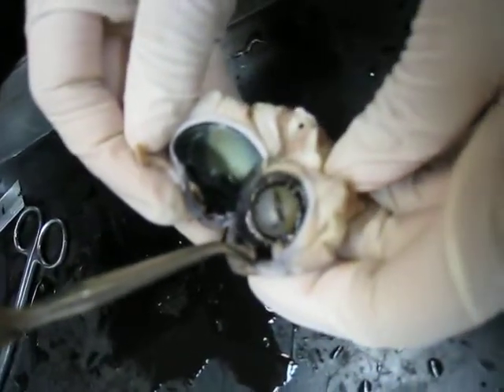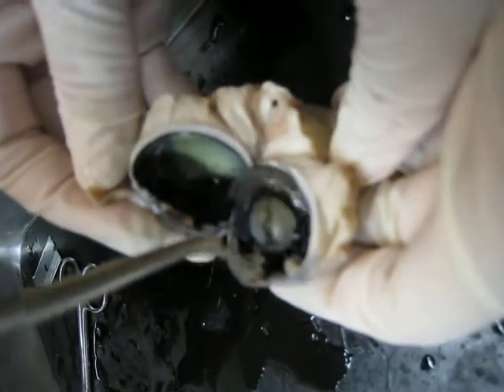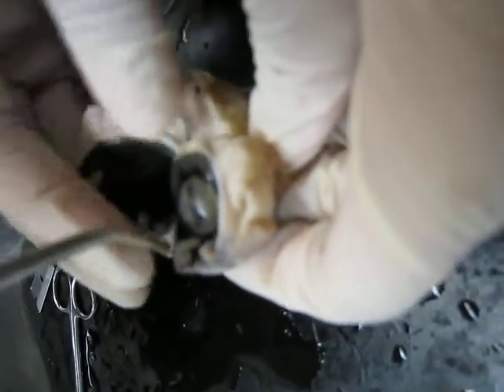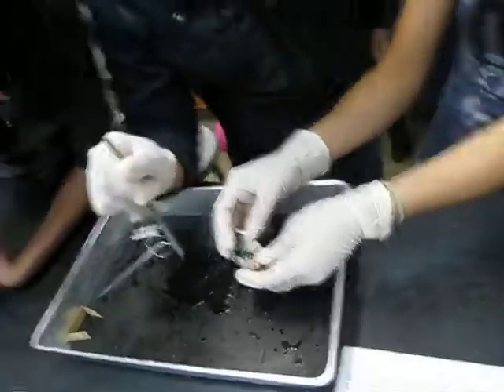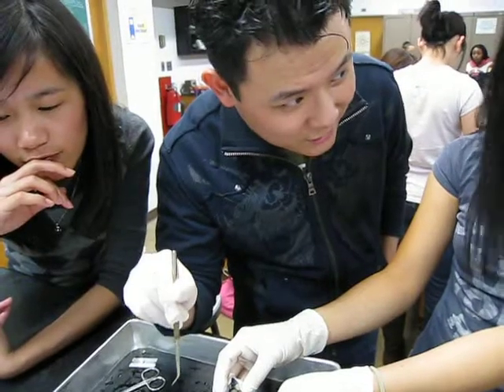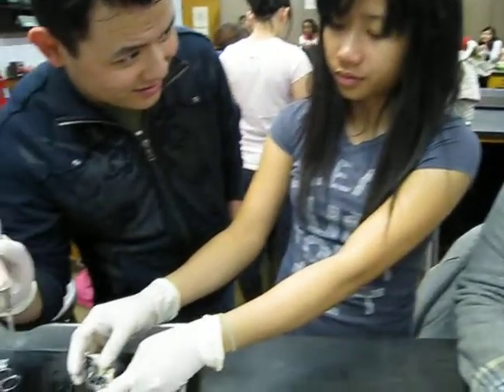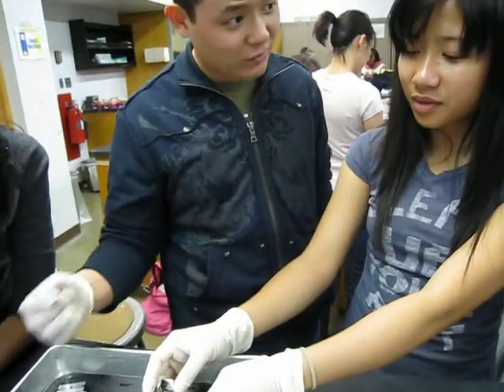From there, if you flip this back to where the lens belongs, right where the lens ends, that's the end of the anterior compartment of the eye. It contains the posterior chamber and the anterior chamber, both within the anterior compartment. Chamber is just a space, but they have a specific name for each one.